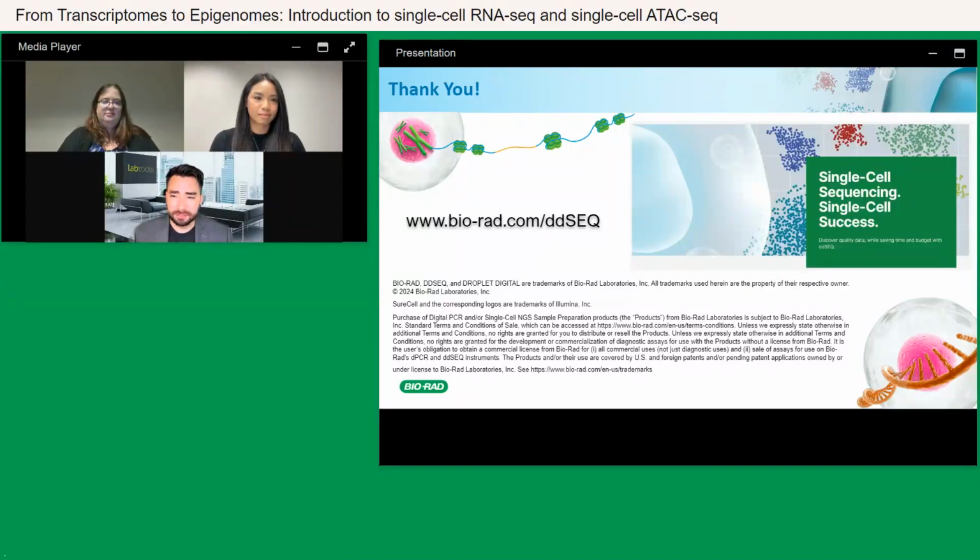All right, thank you for that, Patricia. Let's go ahead and go to our next question here. How does the tagmentation enzyme work?